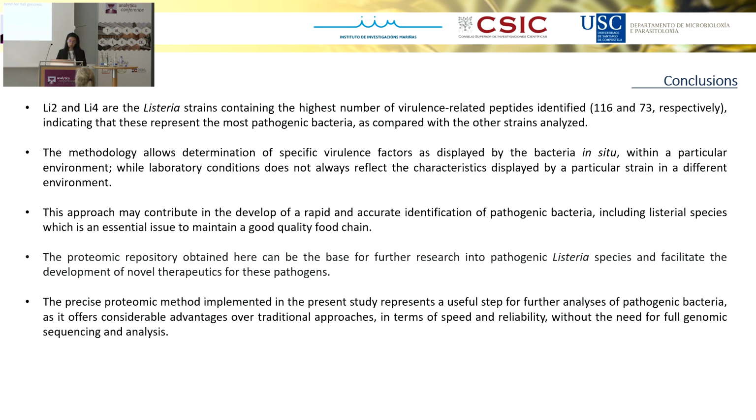The proteomic repository obtained here can be the base for further research into pathogenic Listeria species and facilitate the development of novel therapeutics for these pathogens. The precise proteomic method implemented in the present study represents a useful step for further analysis of pathogenic bacteria, and it offers considerable advantages over traditional approaches in terms of speed and reliability, without the need for full genomic sequencing analysis.